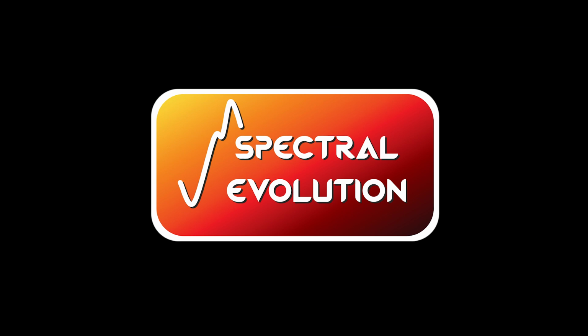Excellent question. So with the pine needle adapter, say you're trying to do a remote sensing study and you're ground truthing airborne or satellite data. You're going to have a coarser spatial resolution or spectral resolution, most likely.